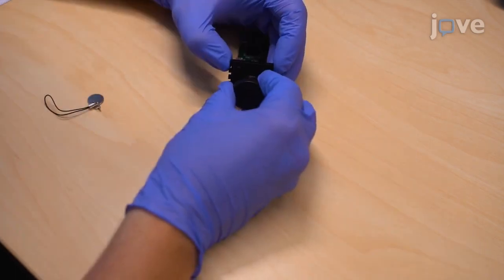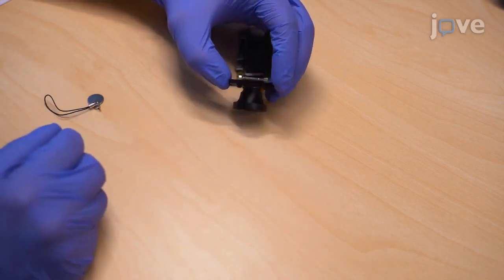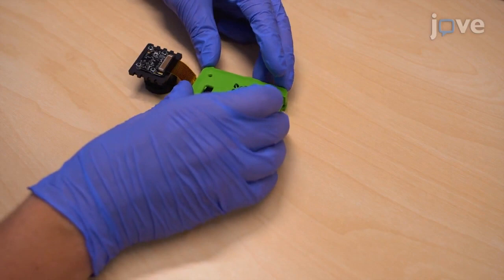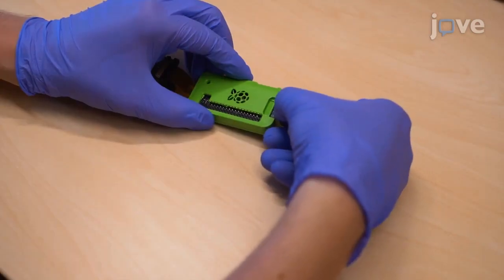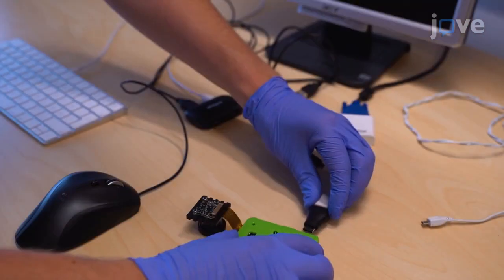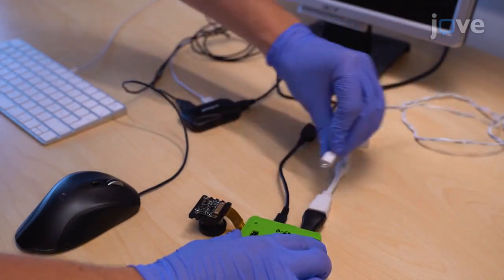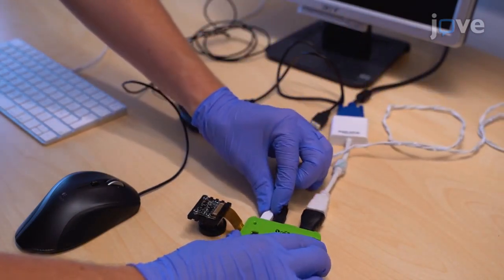Attach the fisheye lens to the metal ring on the camera stand. Place the microcomputer in the plastic case and insert the listed microSD card. Then, connect a monitor, keyboard, and mouse to the microcomputer and start it by connecting its power supply.